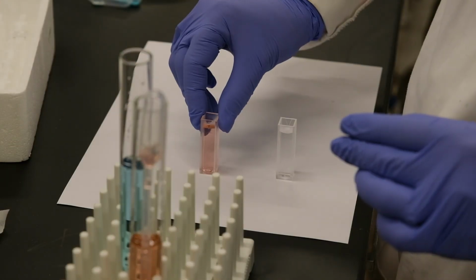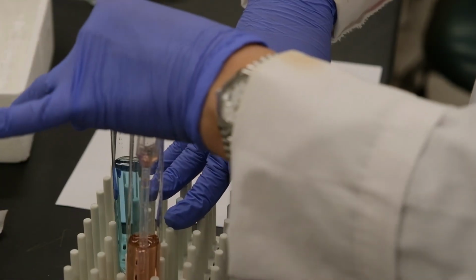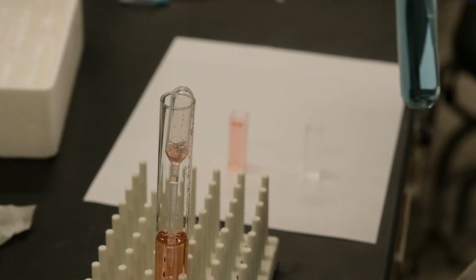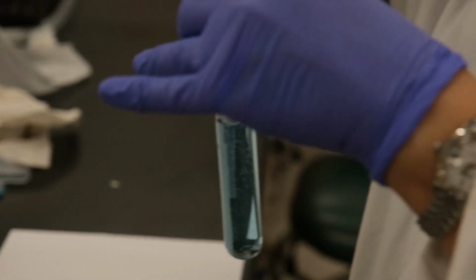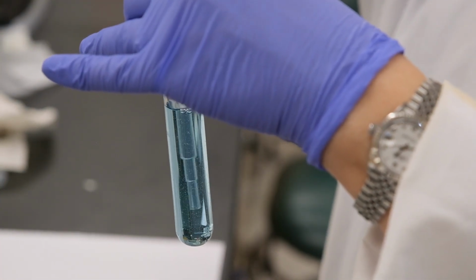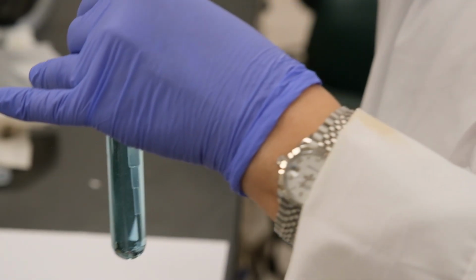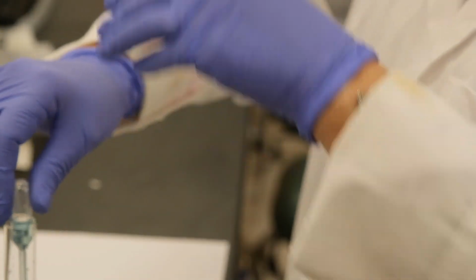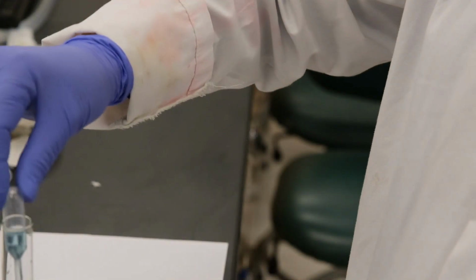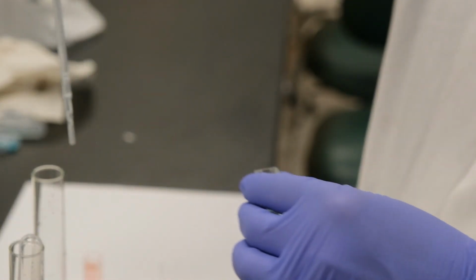Here's the first one, and then we do the same with the next test tube. We mix it up to make sure that the solution is homogeneous and the concentration is the same throughout the tube, and we collect the brilliant blue in another cuvette.